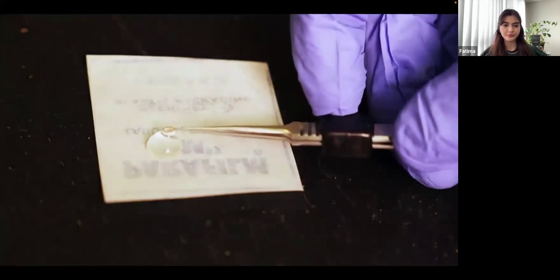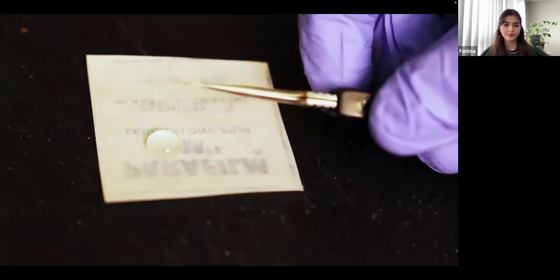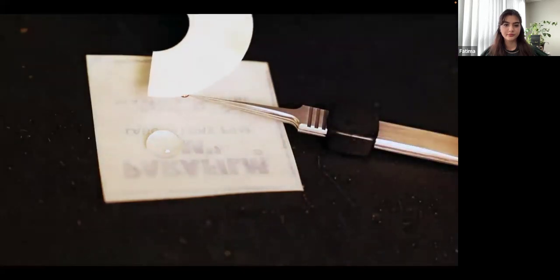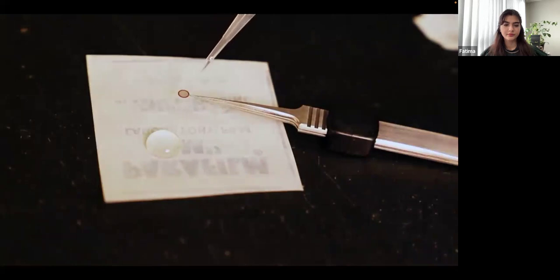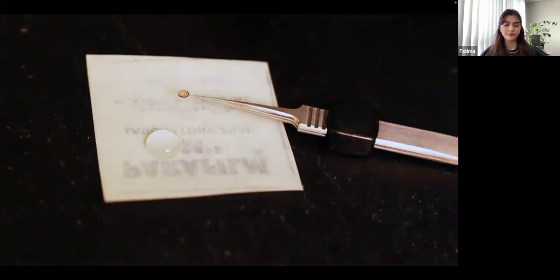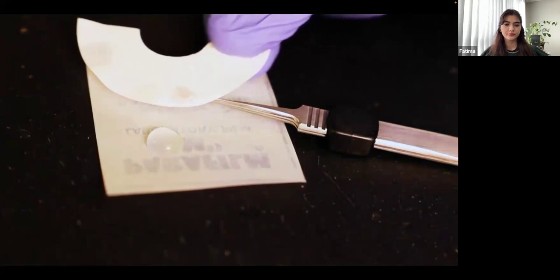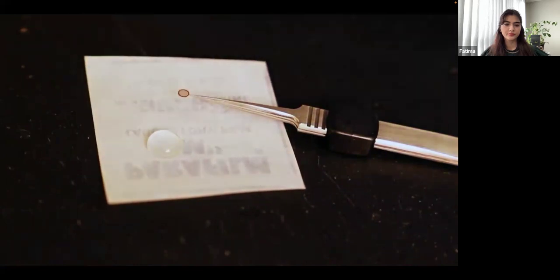The grid is washed with a droplet of water, dried again, and then the stain is applied. The stain, in this case 1% uranyl acetate, is allowed to adsorb for about 20 seconds. The excess stain is blotted away and the grid is left to air dry.